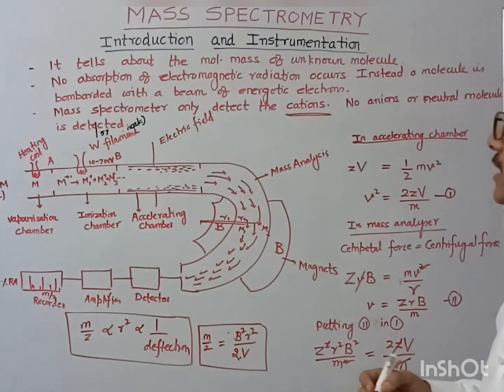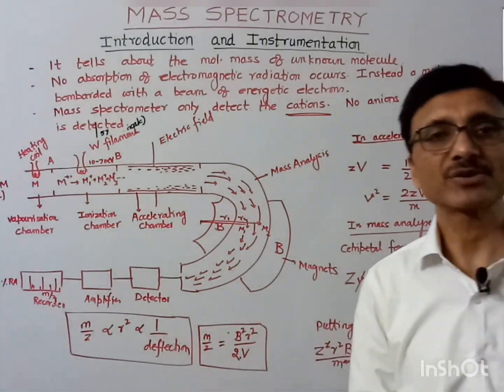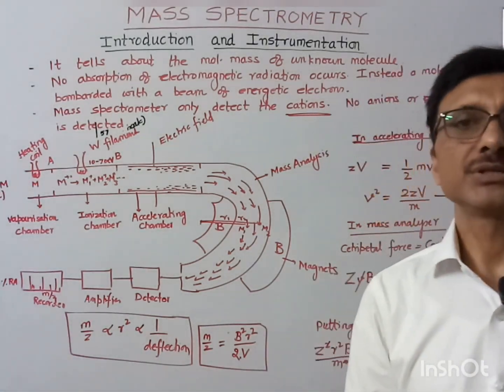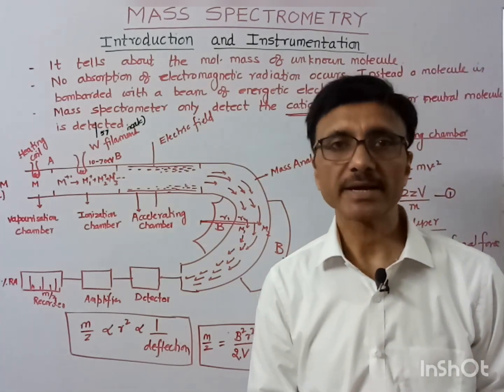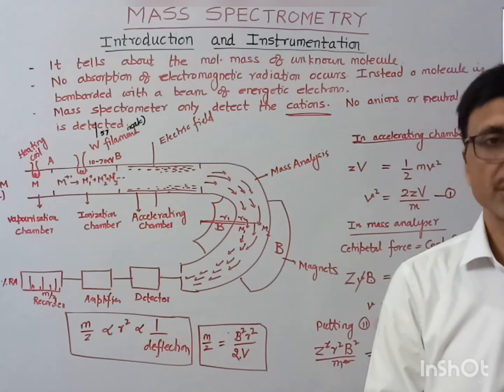So this is the instrumentation of mass spectrometry. In my next lecture, I will discuss the various ionization techniques, and how the ionization takes place.